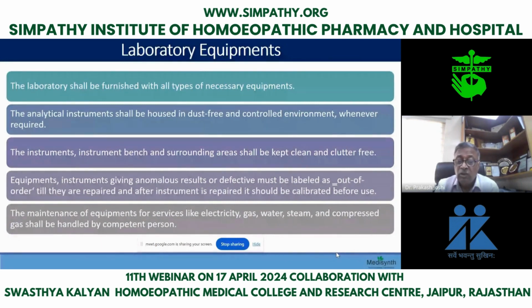You buy an instrument, but there is no maintenance. Then, if it is not maintained, it is not calibrated. It is something like that. You buy an AquaGuard water purifier, and you do not have an AMC. I have seen that people's water has very high total solids. You have to have an AMC so that they properly clean it.